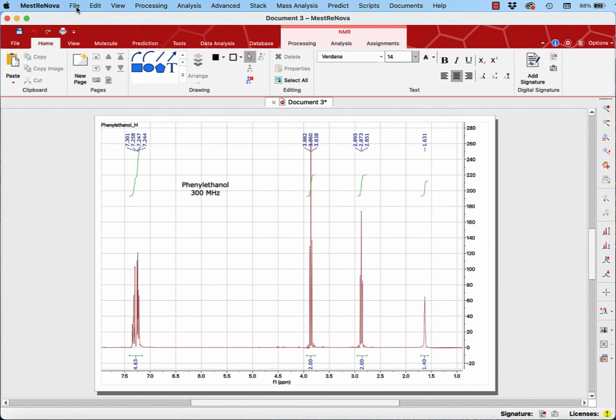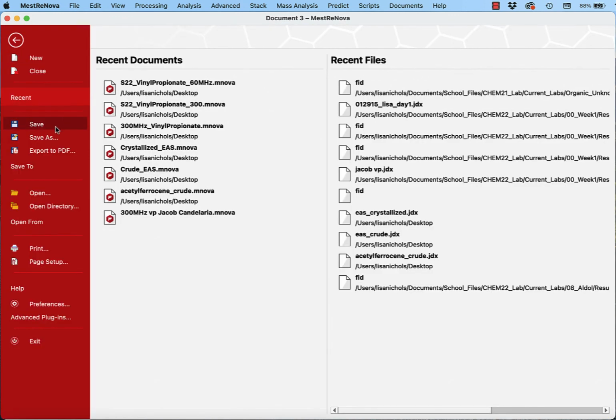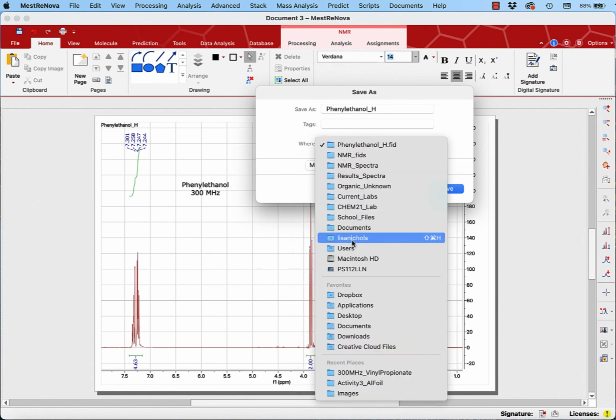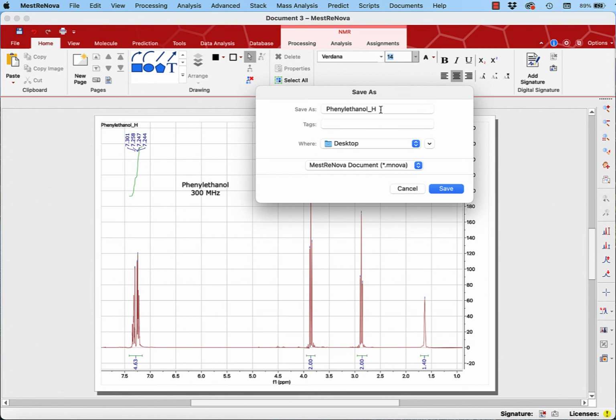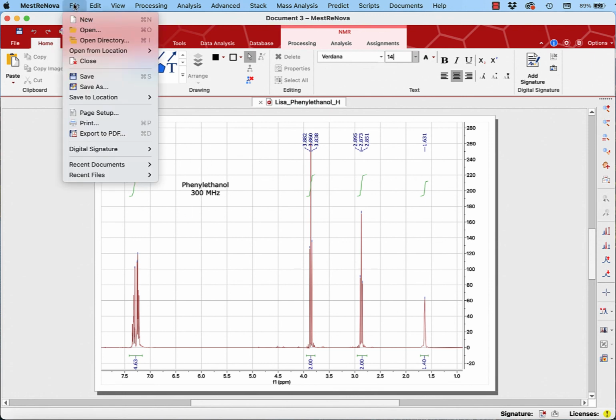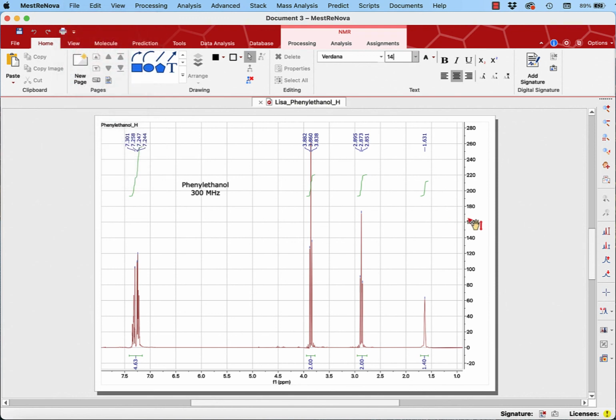So I also really recommend that you save it. So go File, Save As, and we'll just save it on my desktop, Lisa, just because if you push save, if you do have to edit any of this, like if you forgot to do the 3 decimals, you only did 2, it'd be a shame if you had to redo everything, right? So then if you save it, you can just come in and make those quick changes and fix it. You can also then print it, or you can export to PDF to save it, but otherwise you'd be done.